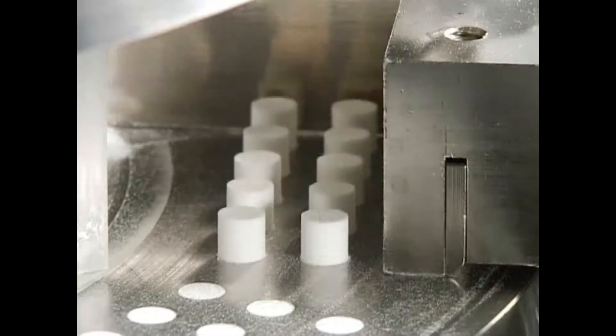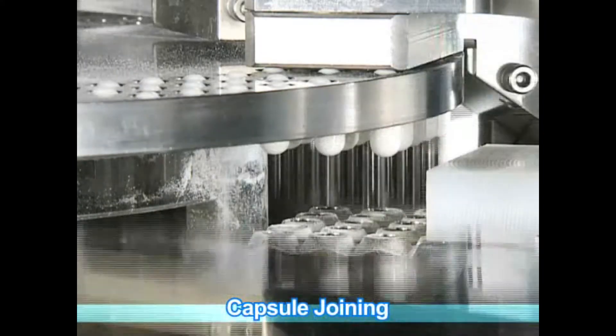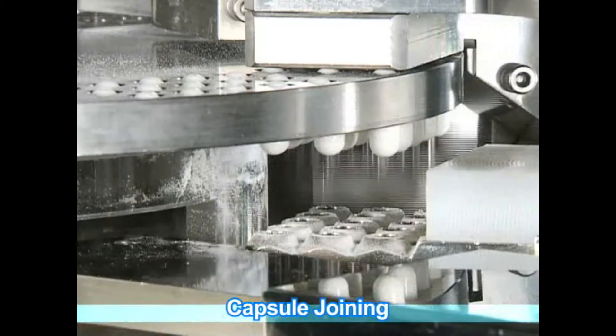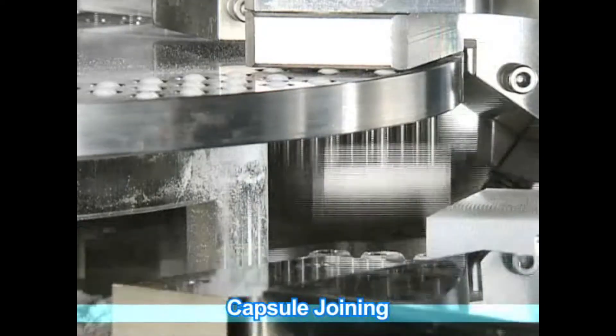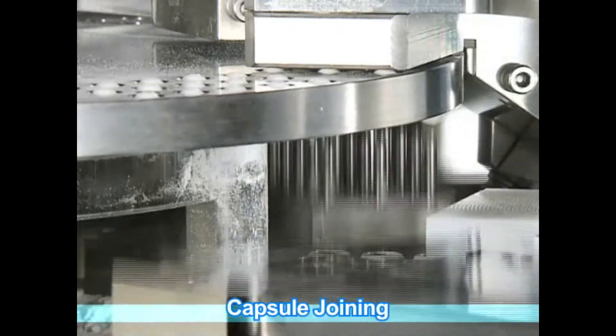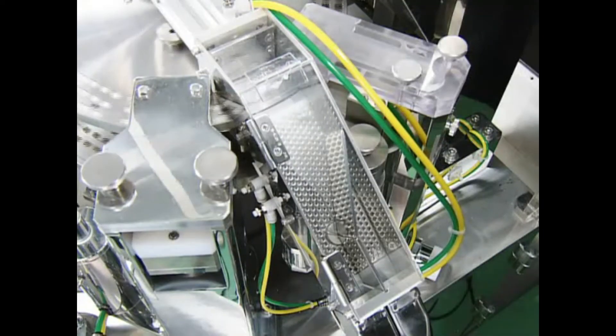For die compression filling, granule filling and liquid filling, the capsule body is filled after volume adjustments. Capsule bodies inside the body disc are raised by a pusher pin to be temporarily housed in the joining block and are joined with a capped disc joining block.